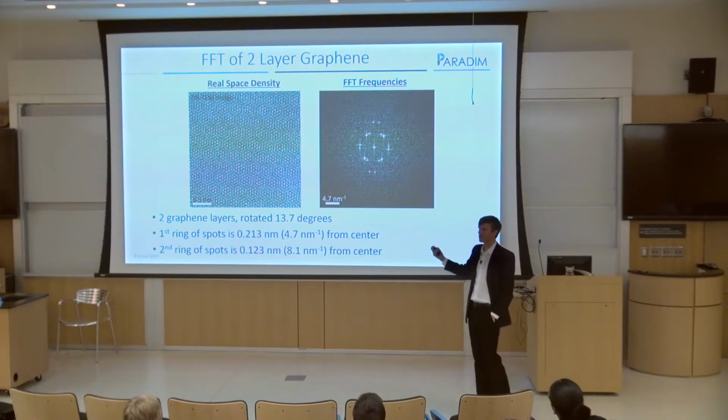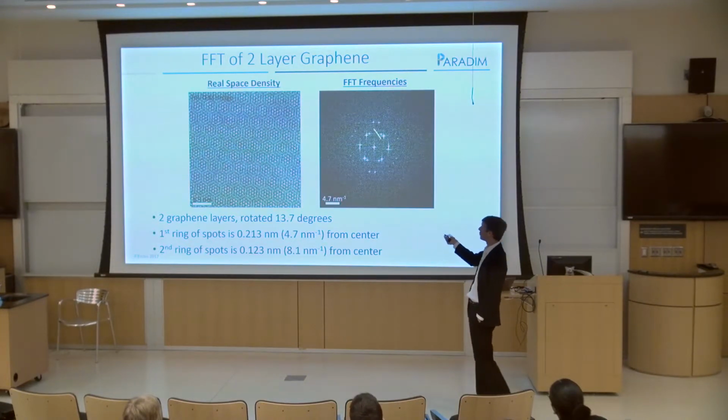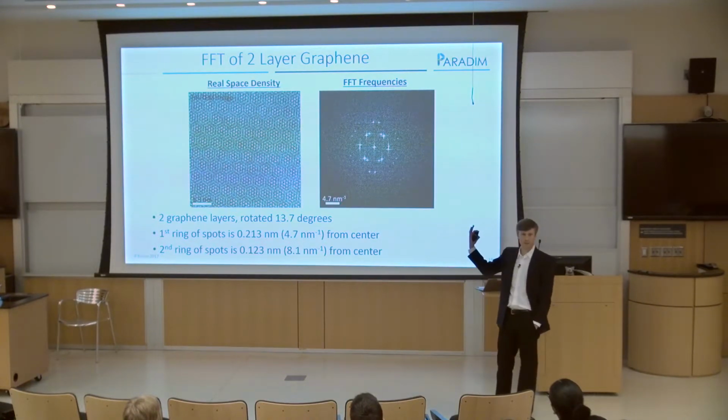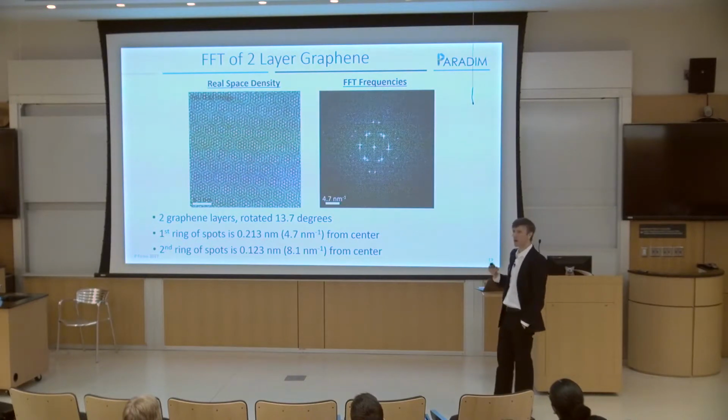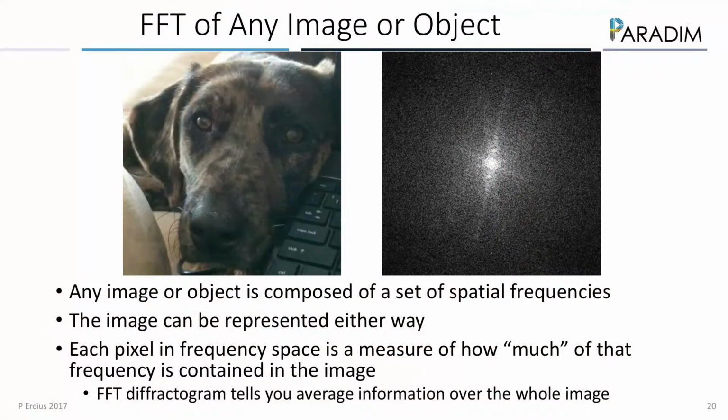It's not tungsten disulfide. It's not something else. And we know that there are 2 sheets, even though from looking at this, we have no idea what's going on. Okay? So I'm just motivating you to look at the Fourier transform and to think of things in Fourier space. It can be very, very useful, and for tomography, it's extremely useful as well. So you can take an FFT of anything, right? Your computer lets you do that.